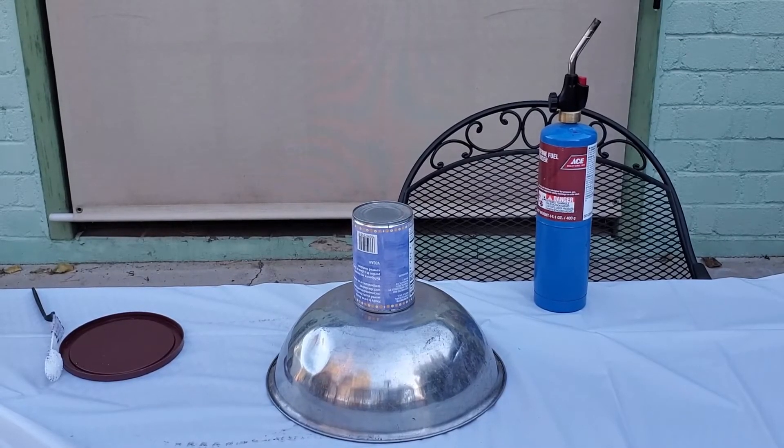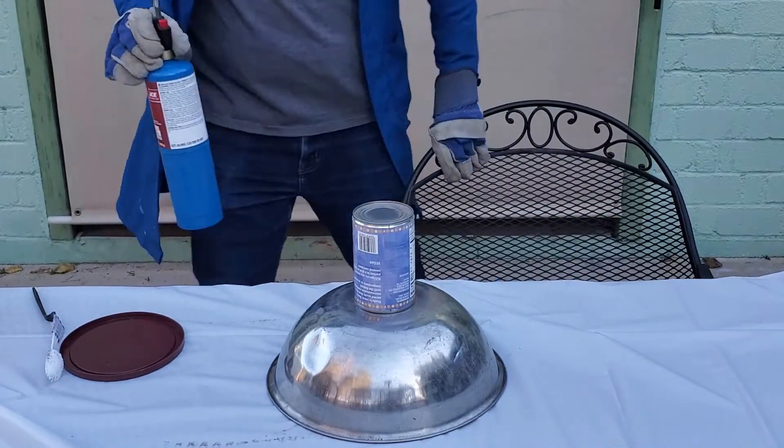After a couple days of drying, I spread out my product on a steel bowl and torched it.